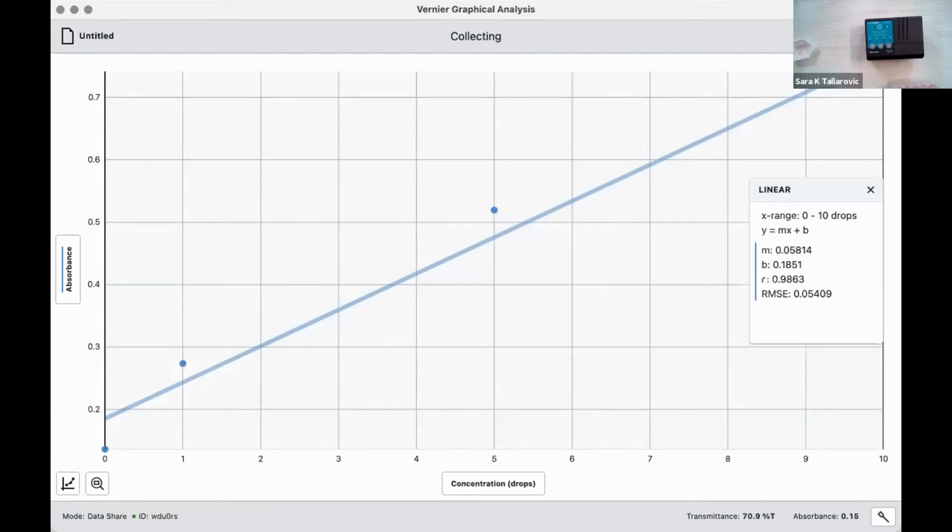Thank you, Colleen. Yeah. So you can see this is a pretty nice tool. Colleen and I are actually across town from one another. Actually, I think Colleen is technically in a different town. I am in Beaverton, Oregon. I'm in Hillsboro. So we are sharing this, and it doesn't matter how many people you connect to. You can have unlimited numbers of students connecting with you. It doesn't matter how far away they are. They can connect as long as they have an internet connection. They can get those data, and then they would want to save them, for instance, on their own device. And that way they can analyze them at home.